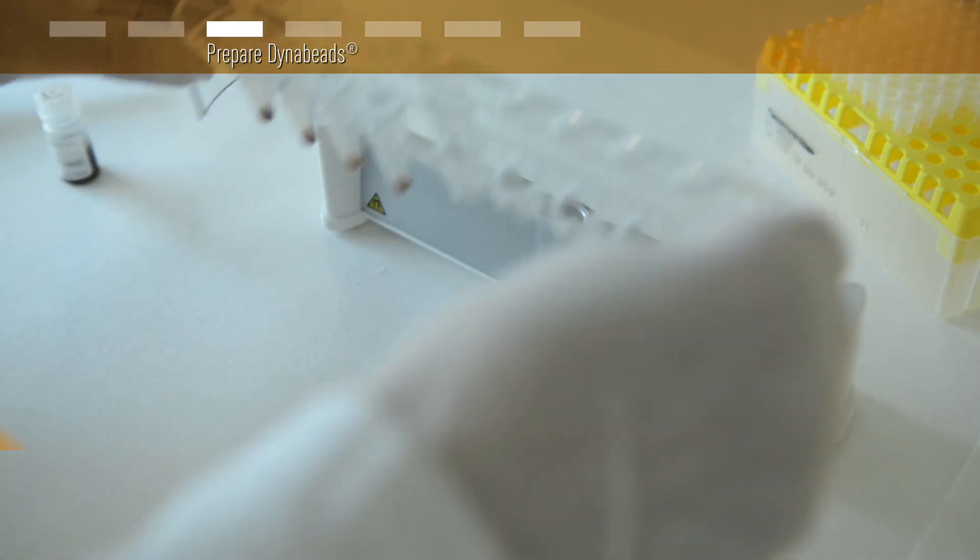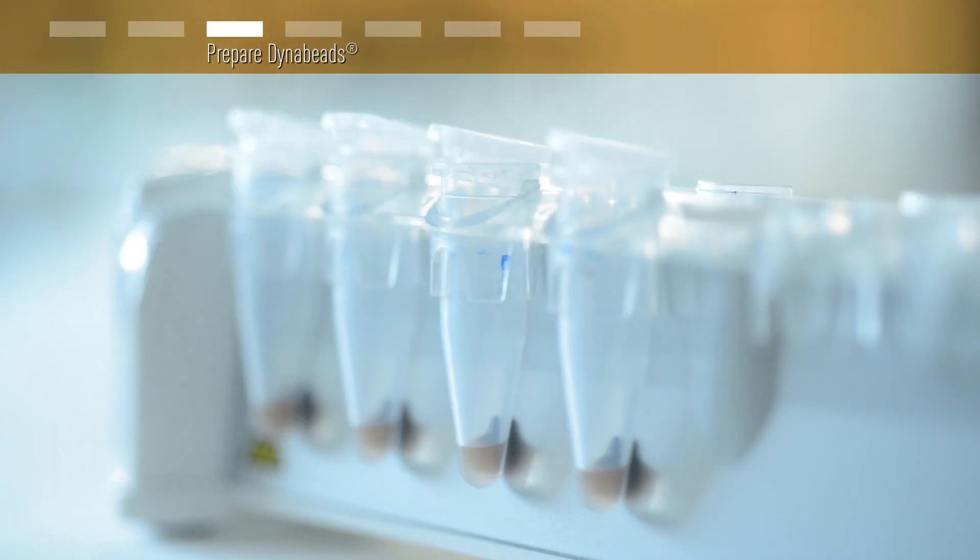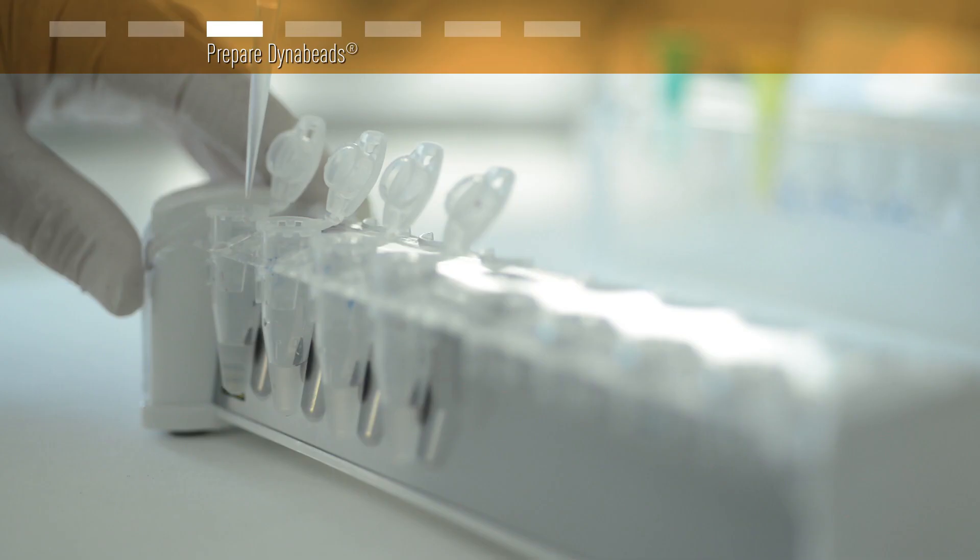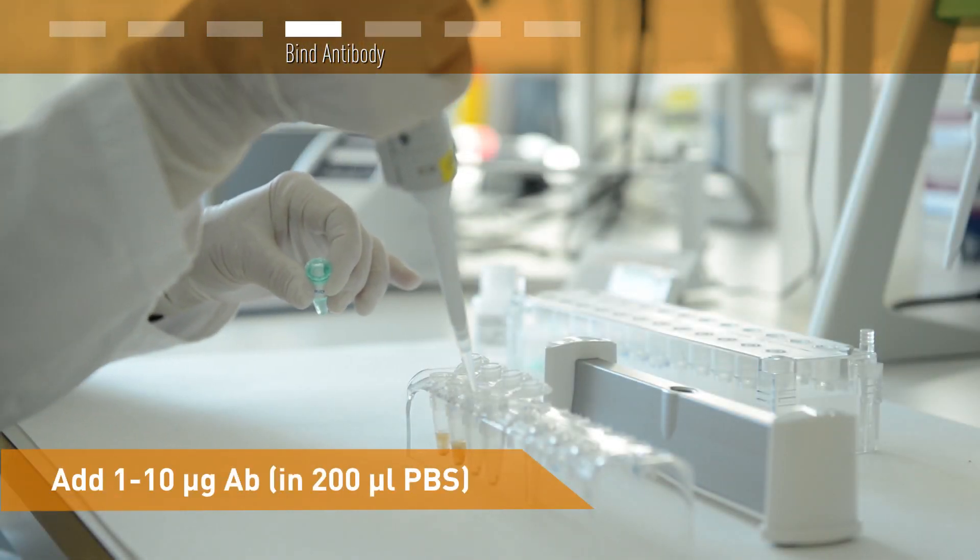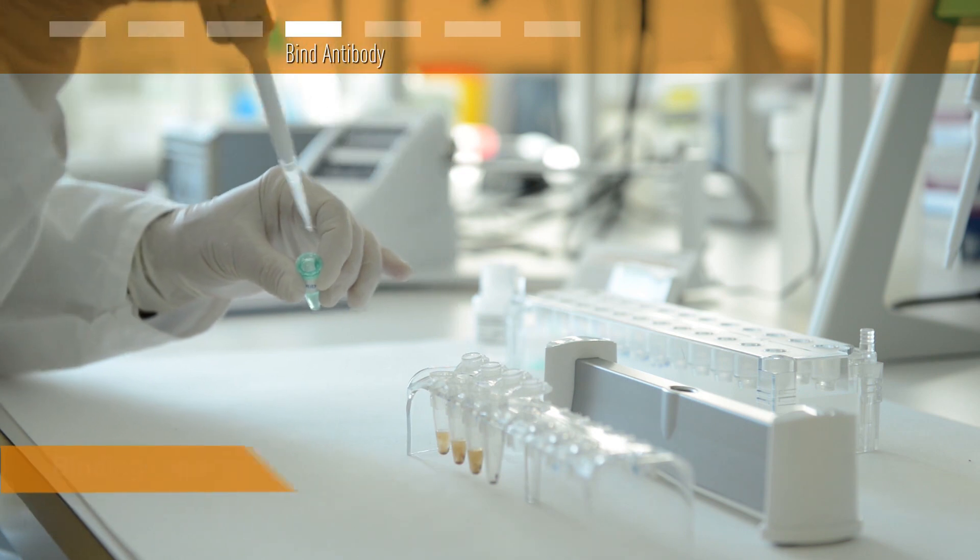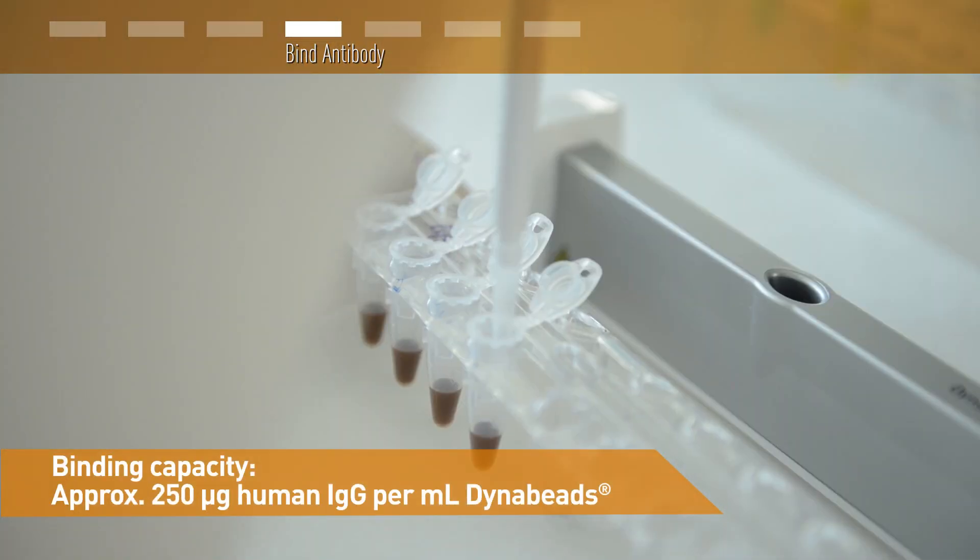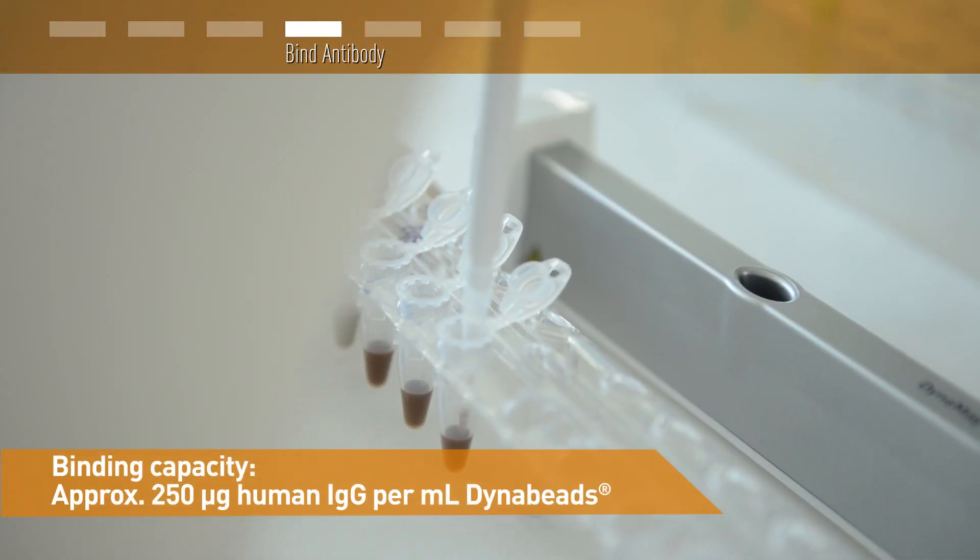One of the beauties of magnetic handling is that you can work with concentrated samples throughout the procedure, and you won't need to pre-treat or dilute the sample. You only need 1 to 10 micrograms of antibody. The exact amount will depend on your specific antibody, and you might want to titrate for minimal cost and maximum performance.